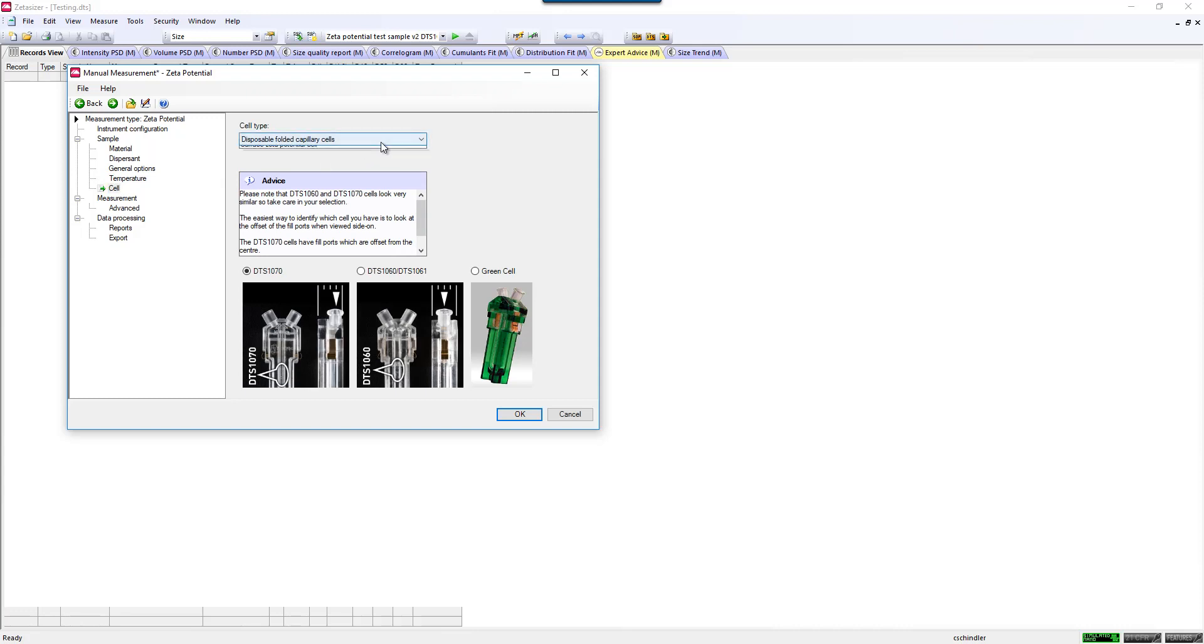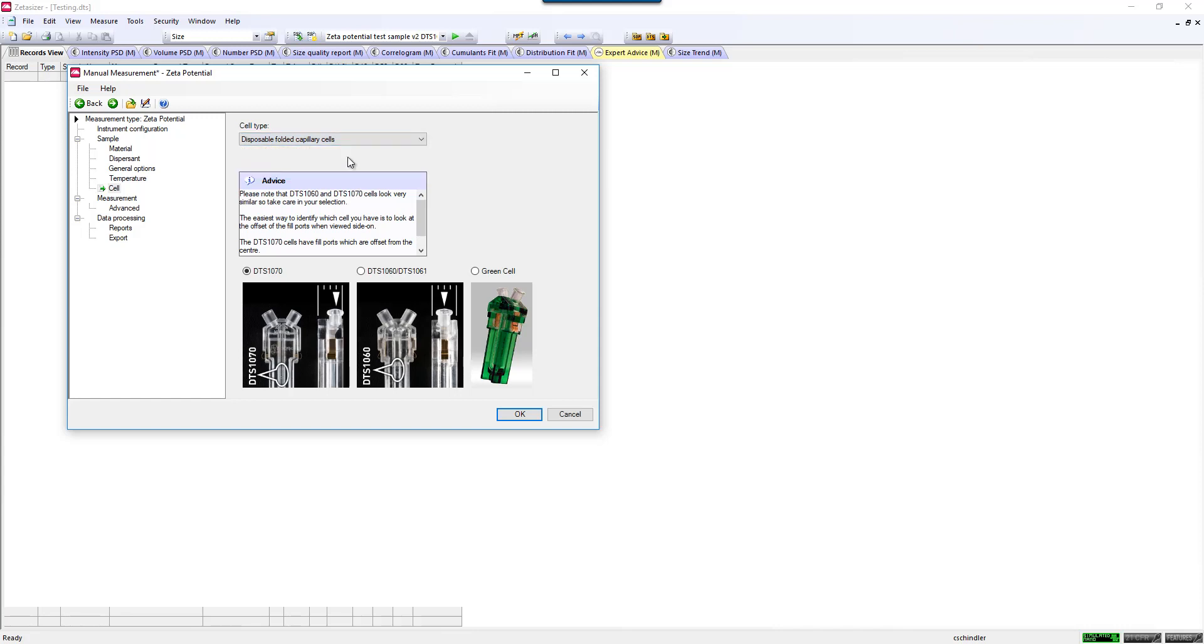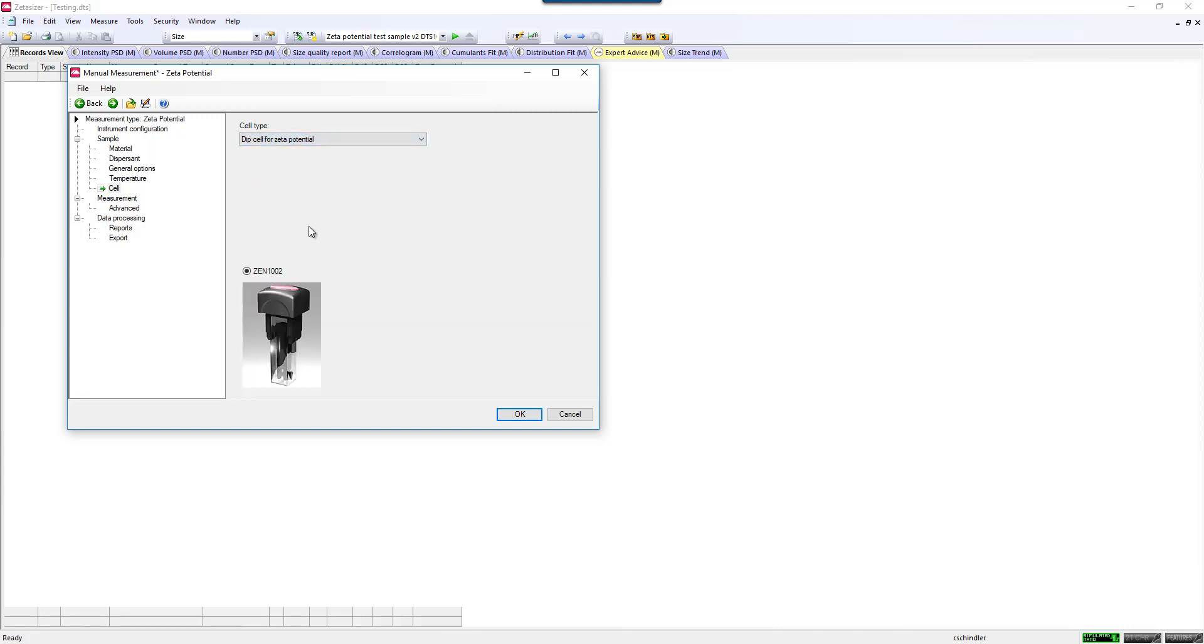Here are the types of cells that are compatible with Zeta Potential measurements. The most common for aqueous solutions is the disposable folded capillary cell. If you want to use organic solvents, you might be using our dip cell, and you can see pictures and product part numbers for each of the cells.